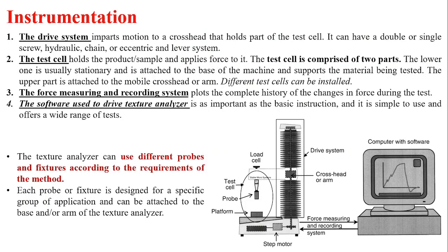The instrument that is used for texture analysis is the texture analyzer. These are the basic parts of the texture analyzer. First is the drive system. It imparts motion to the crosshead that holds part of the test cell. It moves the drive system either upwards or downwards.